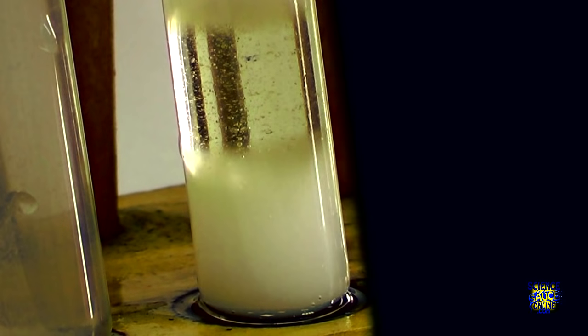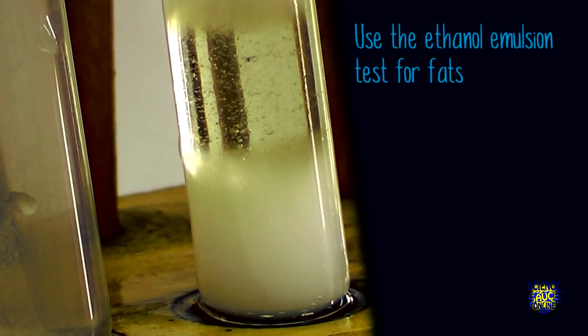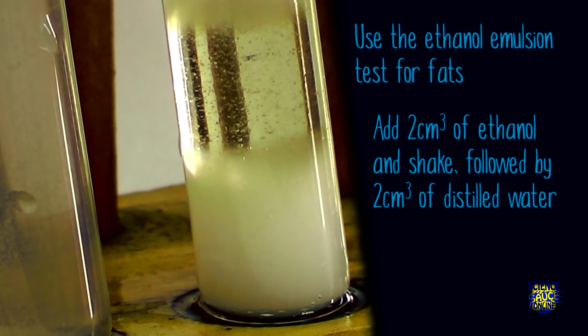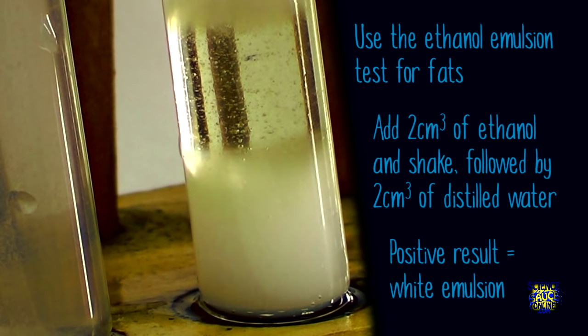To summarize, we use the ethanol emulsion test for the presence of fats. Add two centimeters cubed of ethanol and then shake followed by two centimeters cubed of distilled water. A white emulsion forms if fats are present.